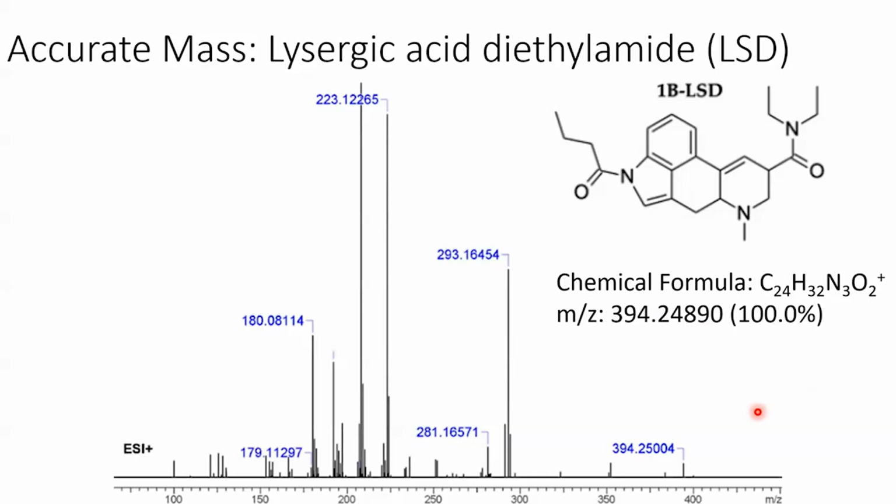And that's true. It's very, very unusual that you will get a perfect match between what you're expecting to see and what you calculate you will see. But the degree of error should be small enough that you can still make a match between the two. One of the things you typically would do is take a known standard and run it through the accurate mass spectrometer, and you would just see how well the mass spectrometer assigns your standard compared to what you expect to see.